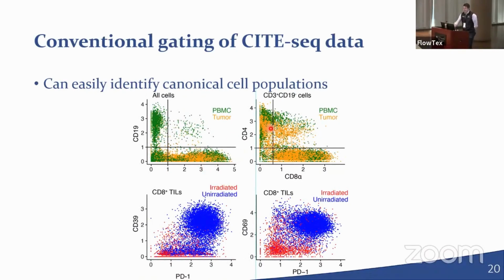So these are T cells. You can gate on that, and you see CD4 versus CD8. And you see there are some double positive cells, but you don't have any compensation to worry about. This is all sequencing. It's all independent of each other.